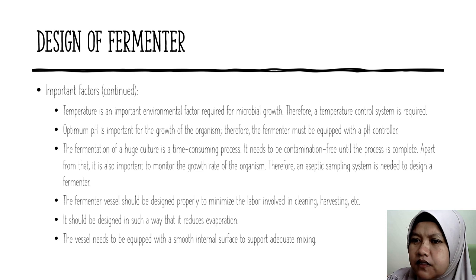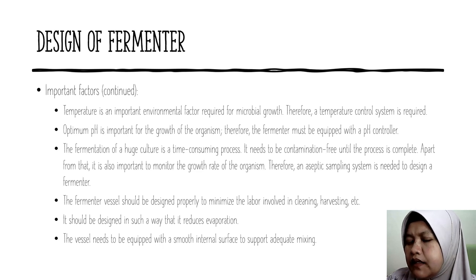The fermenter vessel should be designed properly to minimize the labor involved in cleaning, harvesting, etc. It should be designed in such a way that it reduces evaporation. The vessel needs to be equipped with a smooth internal surface to support adequate mixing.